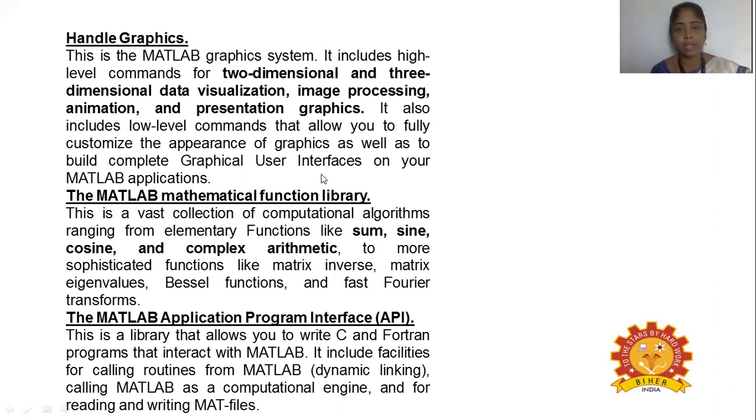So it uses a graphical user interface for your MATLAB applications. Then whatever has been monitored can be stored in a functional library. If we are monitoring the various pH values, the pH will be varying. If you have a set value like 6.8 as the set point, it might go beyond and it might go below, plus or minus. So if 6.8 is set up as the set value, it might vary by plus or minus 1.2, let us take. Those things can be used for summation.